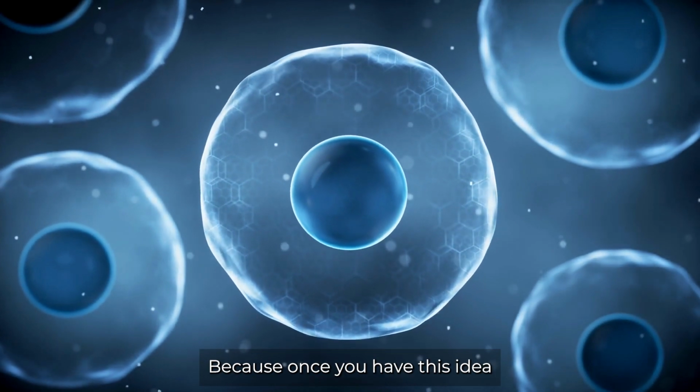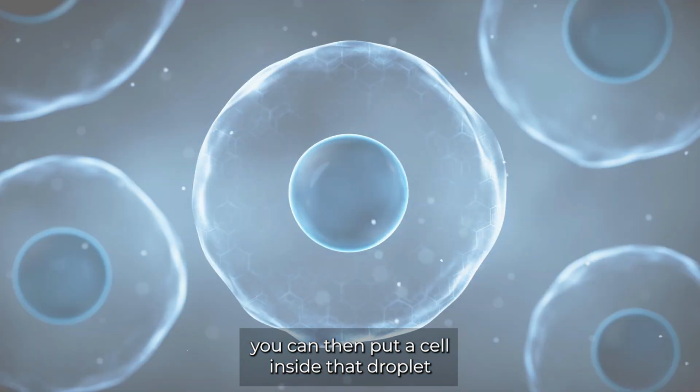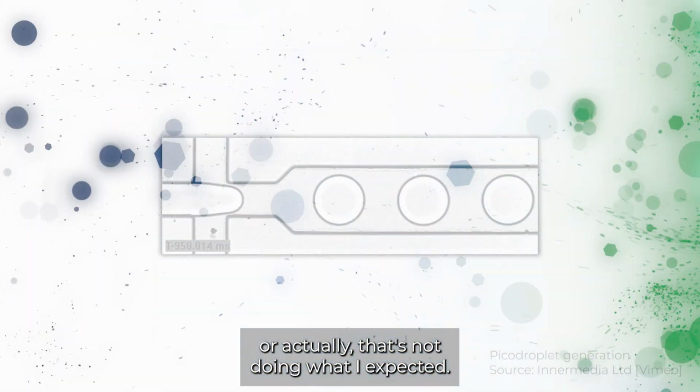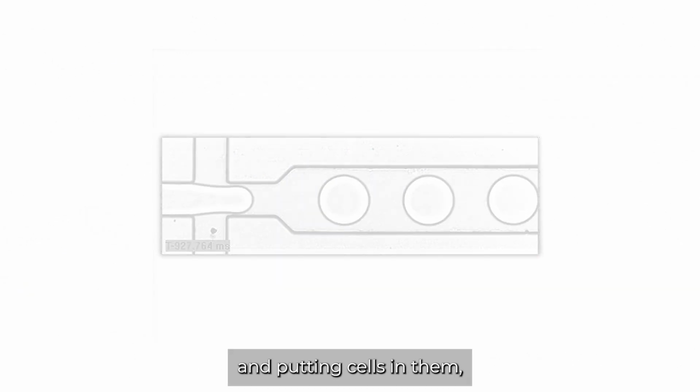And the particular way we've applied it is into cells. Because once you have this idea of a little droplet of water, you can then put a cell inside that droplet, and then of course you can interrogate that cell, understand what it's doing, and on the basis of what it's doing, expressing or some phenotypic response, you can make decisions. That's an interesting cell, I want to continue with it, or actually that's not doing what I expected. So by having this idea of water-in-oil droplets and putting cells in them, you can start to build very fast, very automated systems for looking at cells and making decisions about cells.